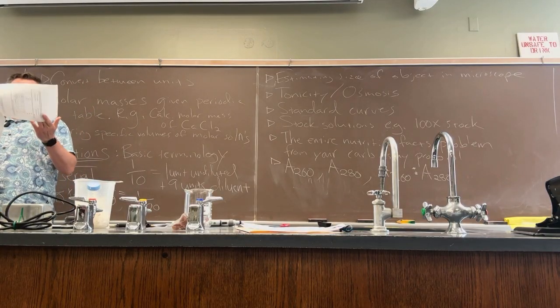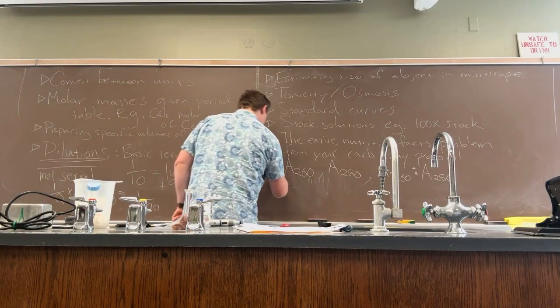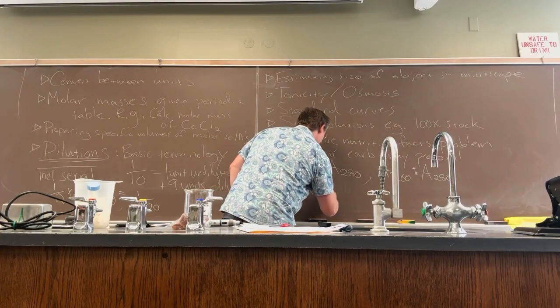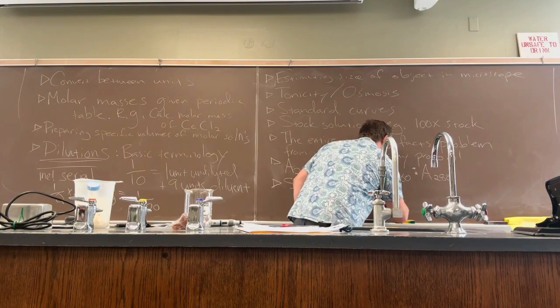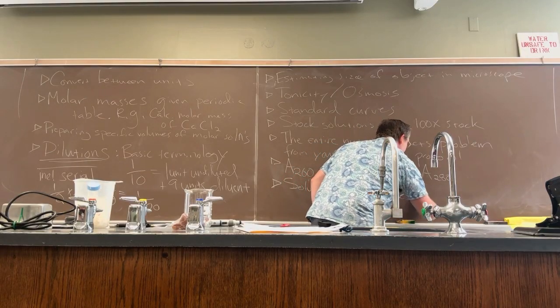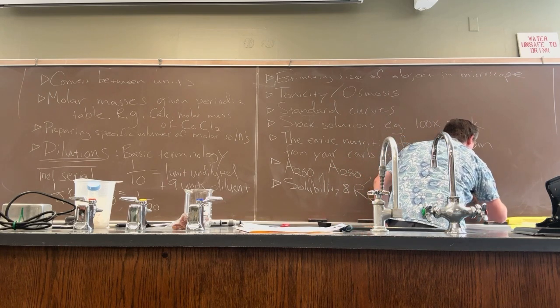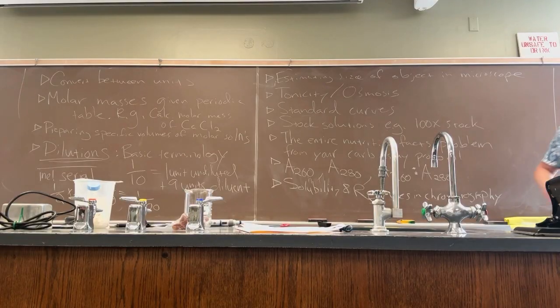There's a question here about solubility and R sub F values in chromatography. Remember, more soluble molecules move further if the solvent's nonpolar.